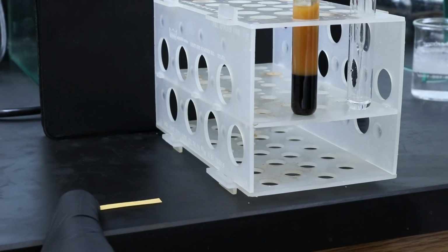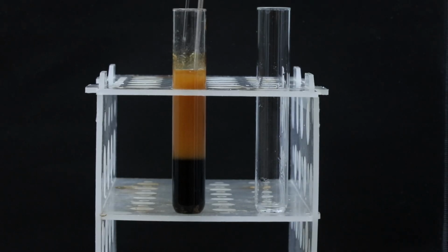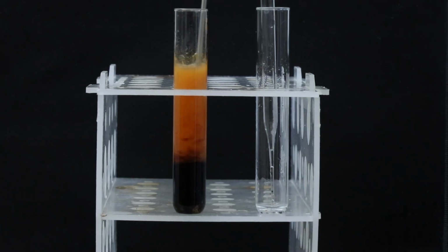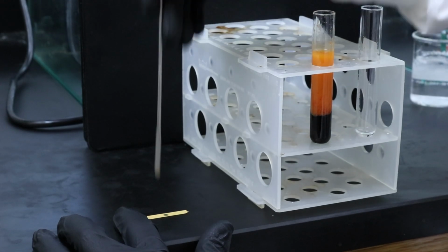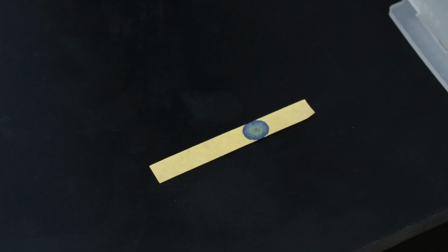After a little bit, I'll test the pH to see if it's been neutralized yet, which it doesn't look like it's quite there, so I'm going to go ahead and add some more base and keep stirring. I'll test the pH once again, and this time it looks like it's basic, which is okay because ketones are pretty stable in basic conditions, so we're good to move on now.